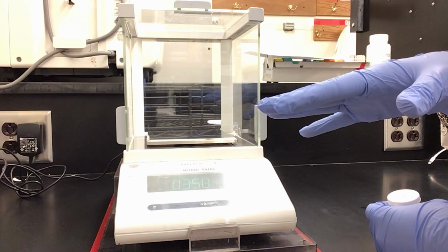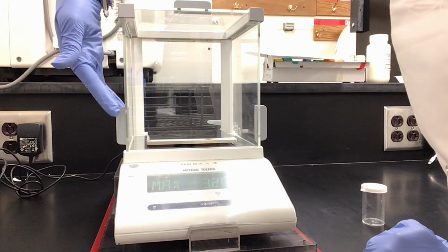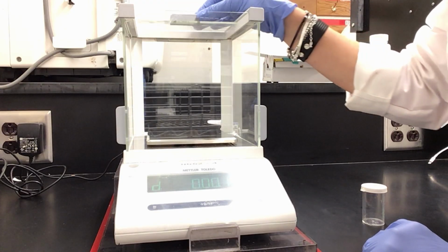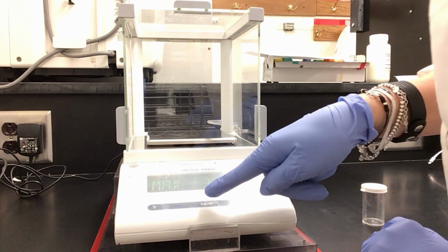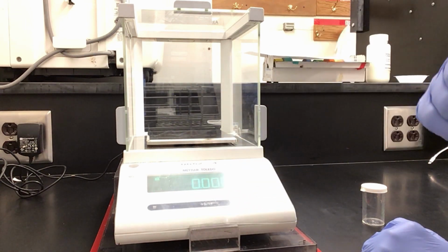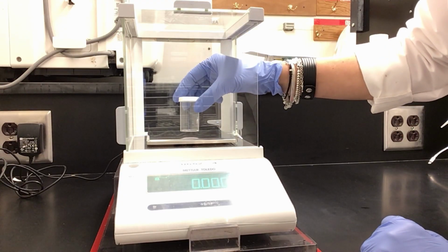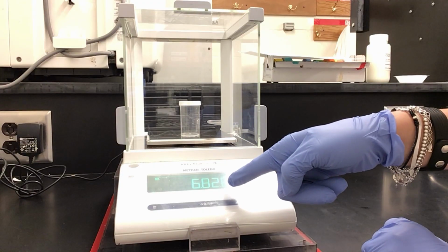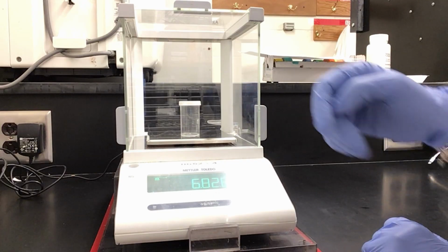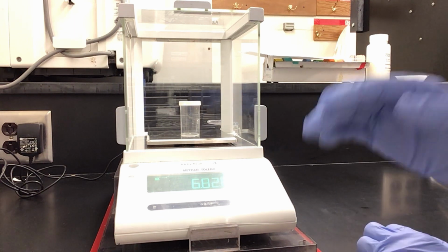So when you need to measure the mass of anything that you're using in a lab, you want to make sure that the doors, see, the doors of the balance are completely closed. There are 3 doors, 1 on top and 1 and 2 at the sides. Then you want to press the 0T right in the middle. That is needed to zero the balance. Then you can open and slide the door, put your item, in this case the vial, close the door, wait for the numbers to stabilize, and then get your reading. So the vial that I am using right now weighs 6 grams, 0.828. And I'm gonna write this down.